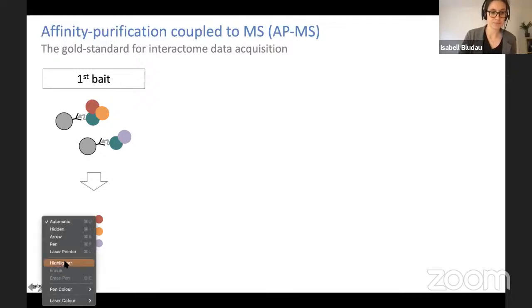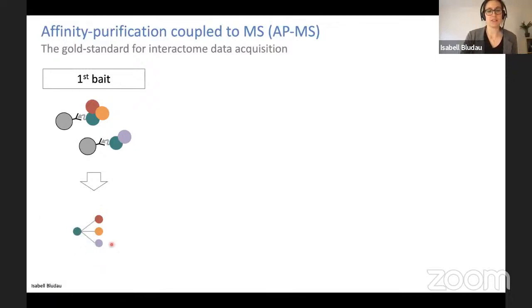And you have several interaction partners that are connected to the bait protein via edges. So this is already fairly nice, but one thing that you already can see is the interaction network is still fairly small, and you cannot directly get information about the actual protein complex modules that are there, as for example here indicated by this trimer and the dimer, which are actually separate complexes.